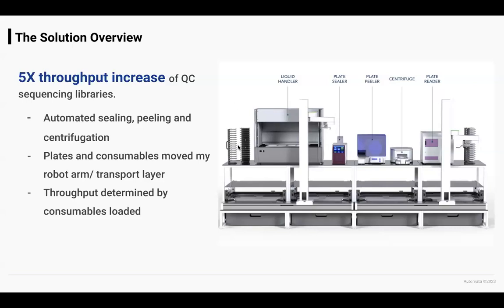So the user would load their samples in these plate stackers here, along with some consumables. And then they would go on to the liquid handler for the quantification preparation. If it's for fluorescence, it might be setting up the dye, setting up the standard, setting up the dilutions. That will happen on the liquid handler, as you'd expect.